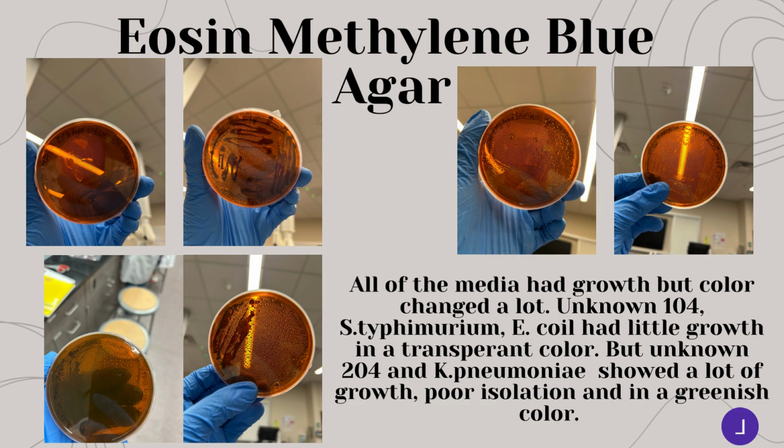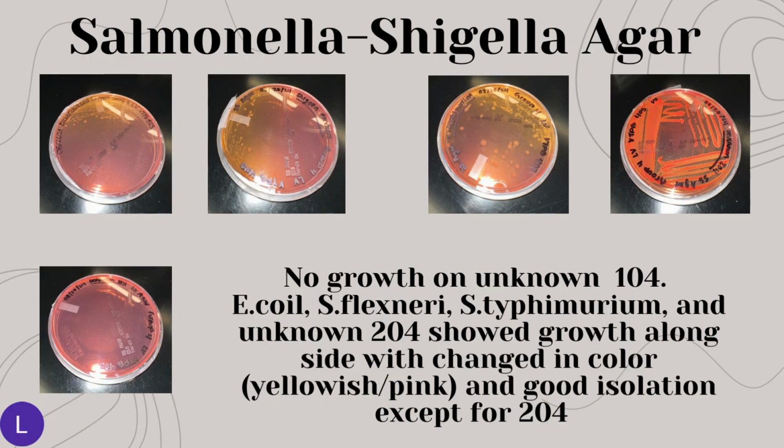Also, I would like to point on this slide, I would be talking about the results from the Salmonella Shigella agar, or SS agar. On these results, we can see the picture on the left bottom, which is unknown 104, and it had zero growth on it.